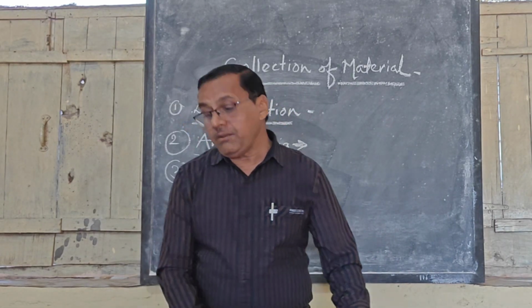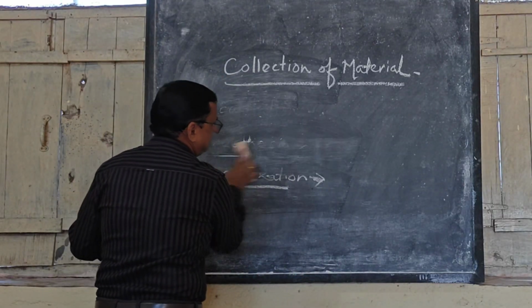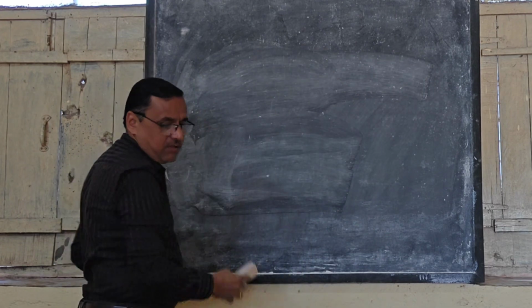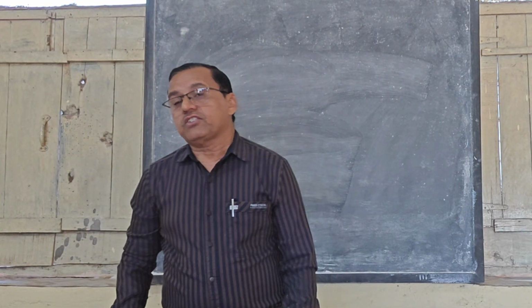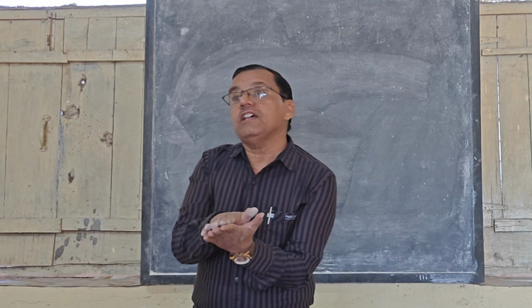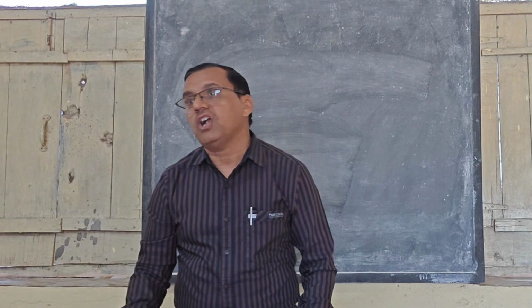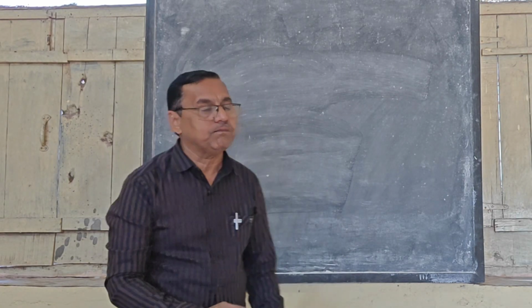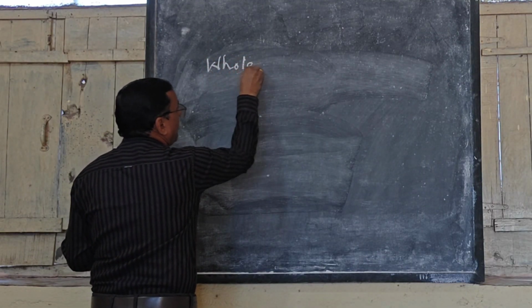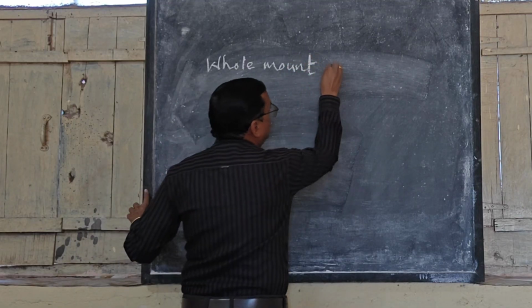Some animals cannot be dissected, so they can be directly mounted on the slide, as they are. This process is called whole mount preparation.